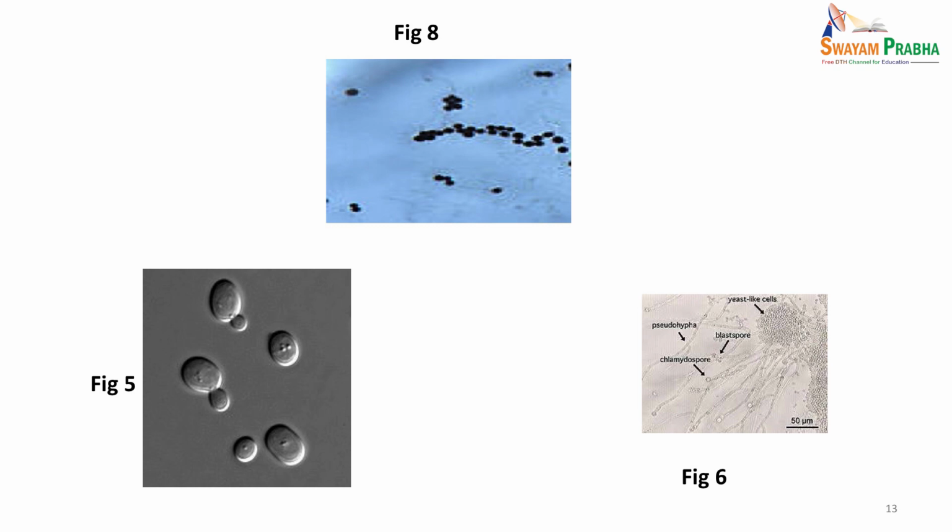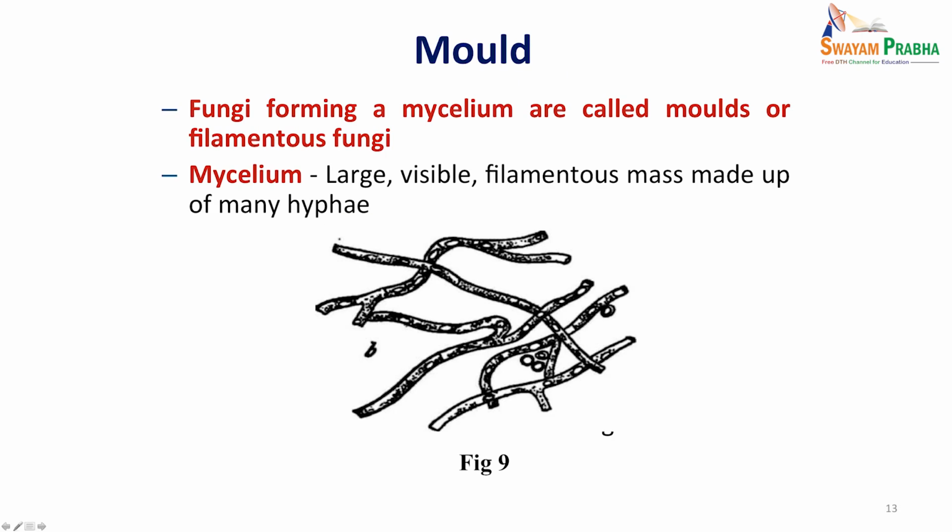The same when they get elongated, they form pseudohyphae, but there is a constriction between the main cell and the smaller cell. While in a true hypha, there is no constriction seen. So, this is how to differentiate it from pseudohypha.